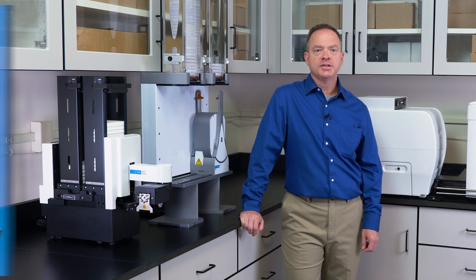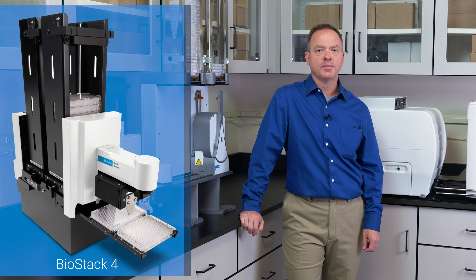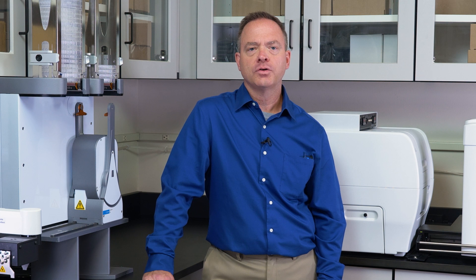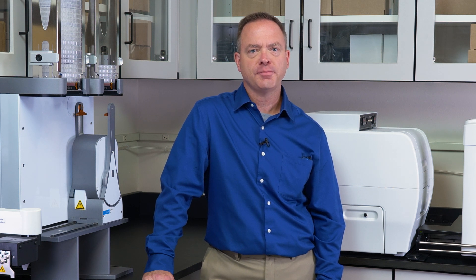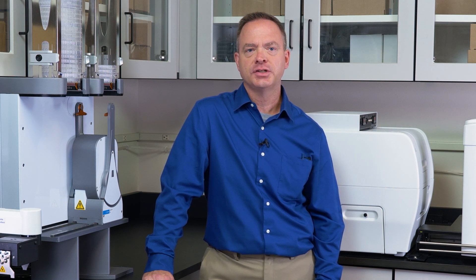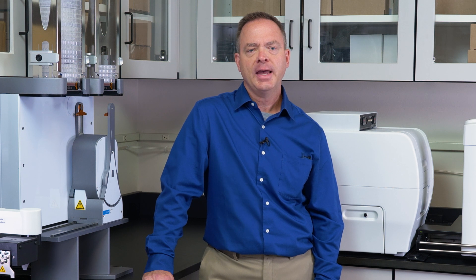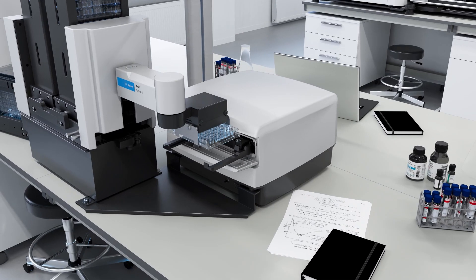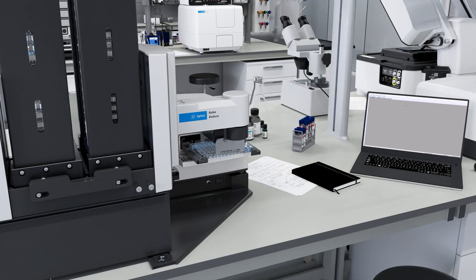The patented BioStack 4 model also offers efficient de-lidding and re-lidding of Microplates for sensitive cell-based assays. No matter which instrument is connected to the BioStack, each combination takes up minimal bench space and can easily fit inside a laminar flow hood for sterile sample processing.